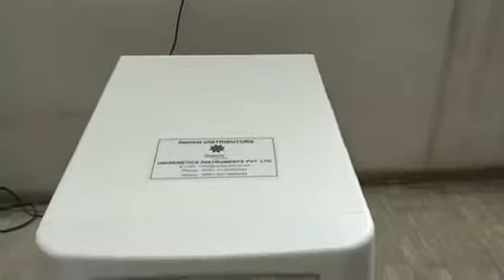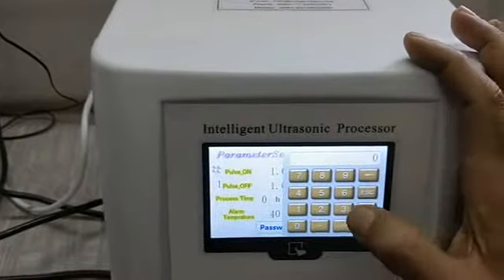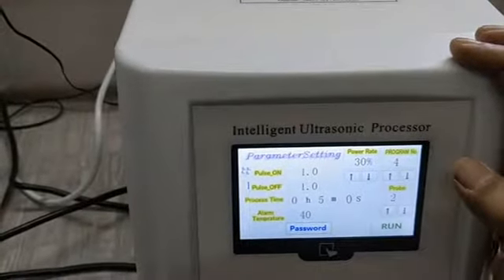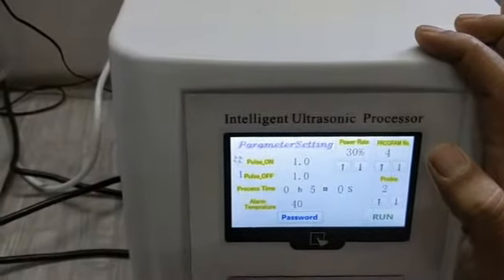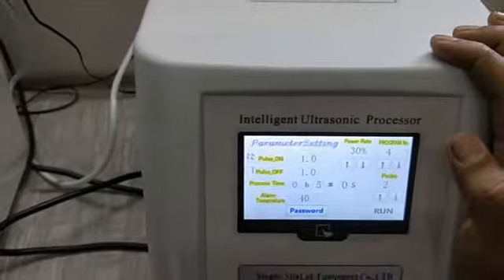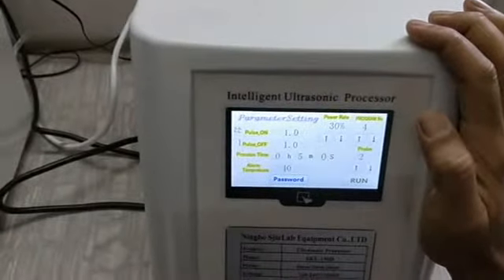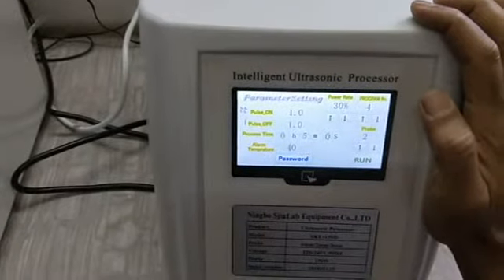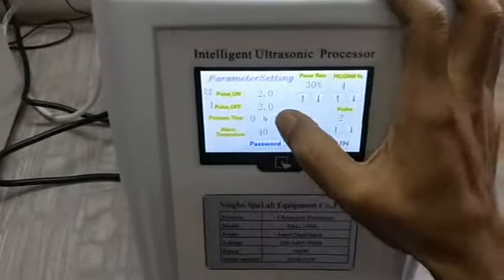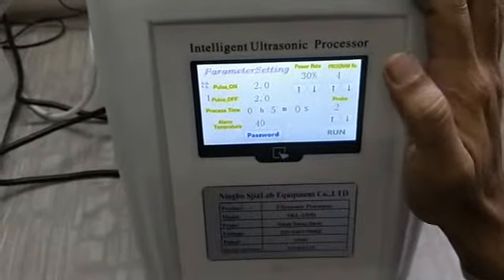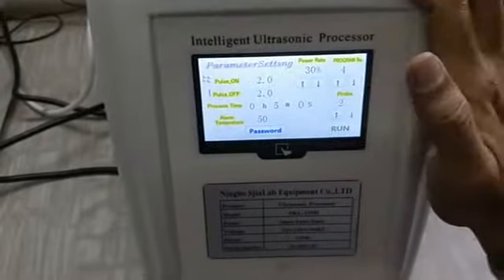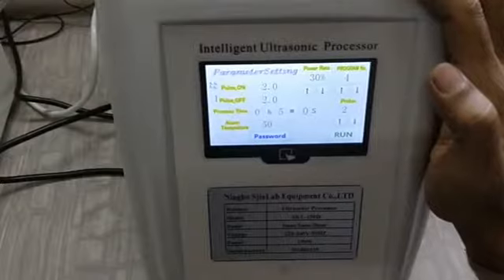For the demo, I will give only 30% power. I am giving the power rate at 30. This is my pulse on and pulse off. Theoretically you can go pulse on and pulse off up to 99.59 seconds. But actually we should not give more than 4-5 seconds. After 1 on pulse, we should give at least 2-3 seconds off pulse so that the life of the probe and machine will be very good. I am giving pulse on, say, 2 seconds, and pulse off again 2 seconds. The total run time is 5 minutes, 0 hours, 5 minutes, and 0 seconds. My alarm temperature: suppose my sample temperature should not exceed 50 degrees centigrade, so I will say 50. These parameters are stored as program number 4.